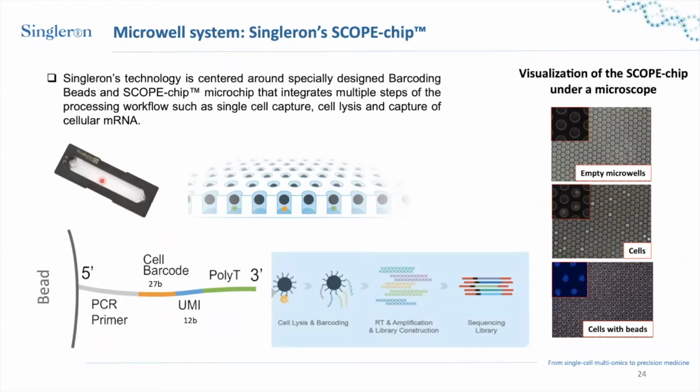And the white part you see here consists of thousands of wells depicted here. And you can see there are two ports, one inlet and one outlet. So you can inject your cells from here. It flows through. And during this flow, cells, thanks to gravity, sink. So this is one of the major differences between a droplet-based system and a microwell-based system. A microwell system is gentle to cells. You don't pressurize anything.